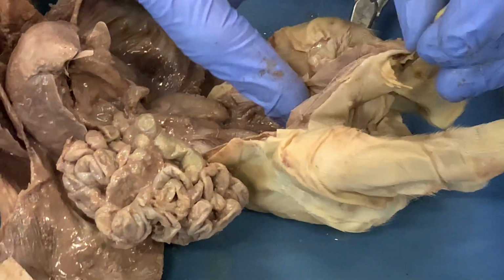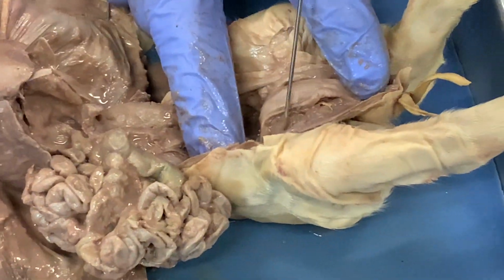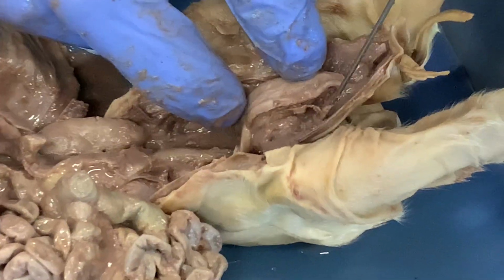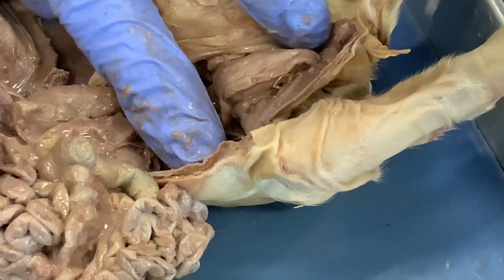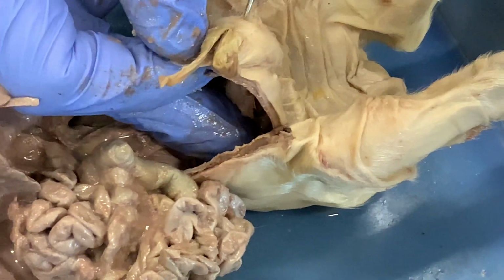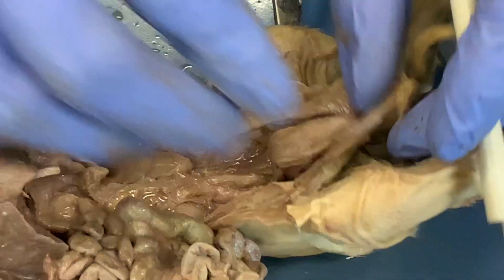The reproductive organs are down behind the bladder and connected through a second set of tubes inside here to the urogenital opening as well.